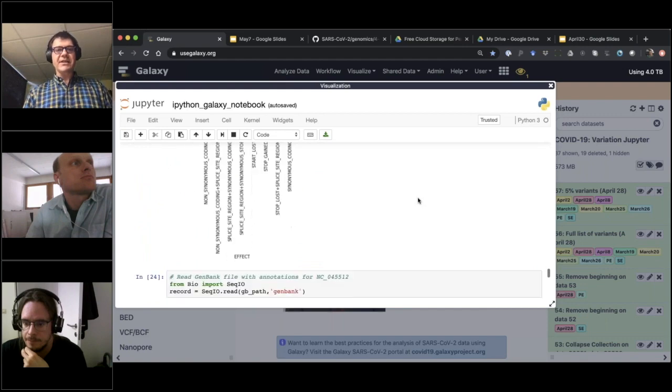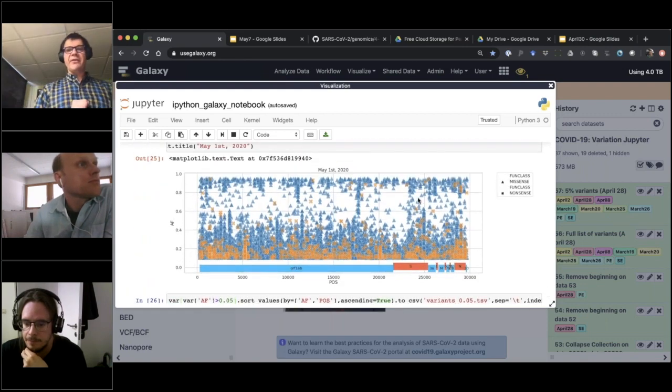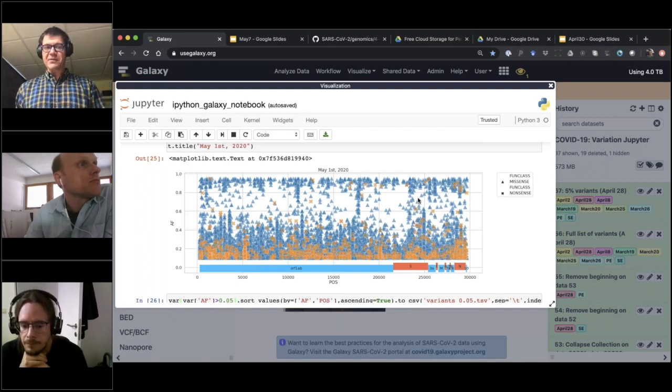And one of the analyses I've done is, for example, a distribution of two kinds of substitutions, two kinds of variants: non-synonymous substitutions that change amino acids and nonsense substitutions, which create stop codons. And of course, you can see that low frequency cloud of orange of these nonsense substitutions, most of which are probably spurious artifacts.